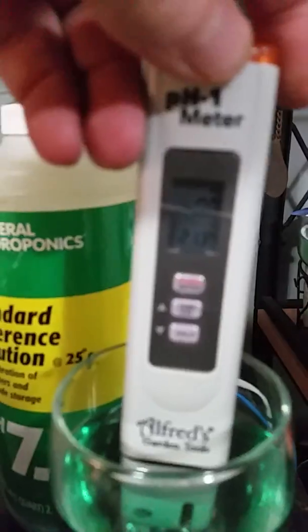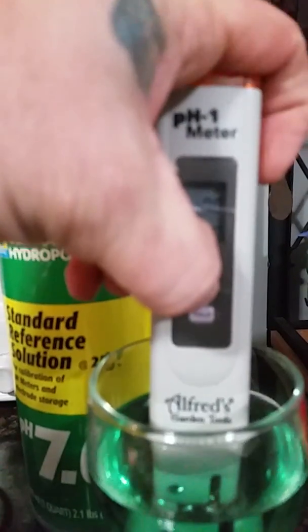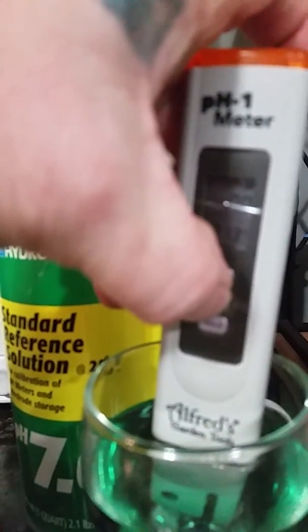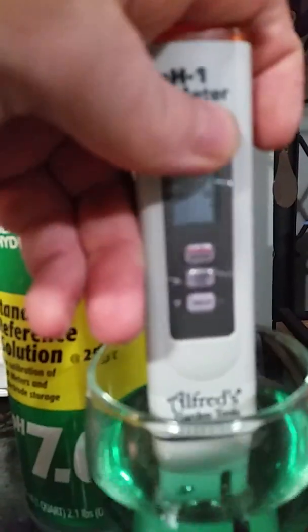As you can see, mine's sitting on seven in the seven and four in the four. You want to hold it on your middle button — it pops up 'calibrate.' Then you can select it up or down with these ones and we're looking for a seven.